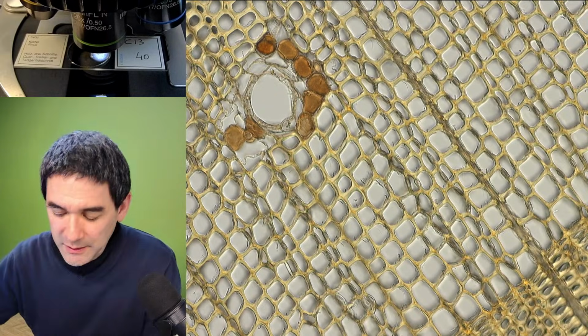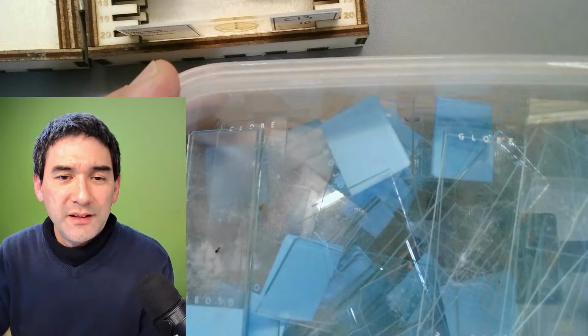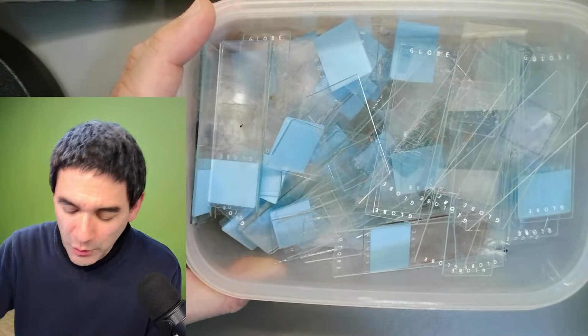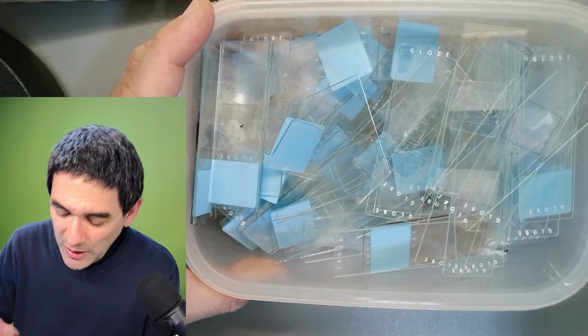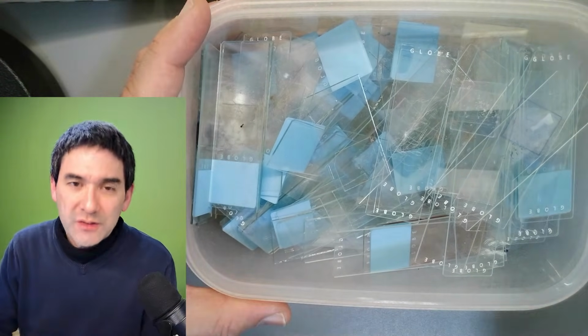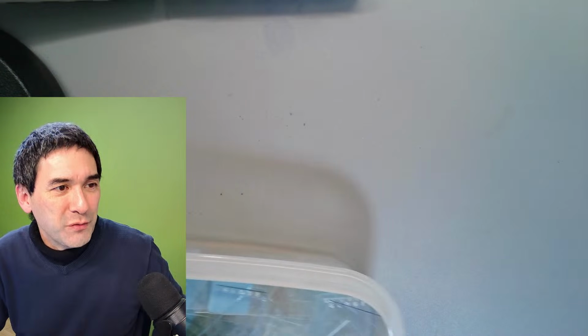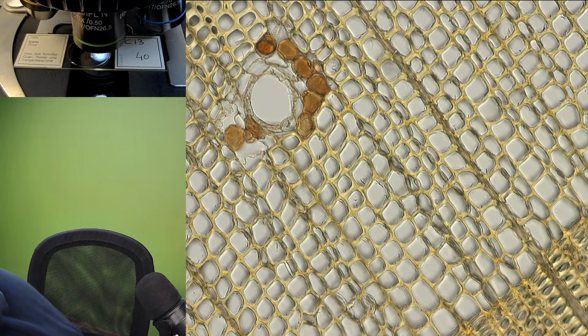I always dump the slides into a plastic box like this, right? And then I wash them. I pour hot water over it, and then I wash each one individually. So I'm reusing those. That's basically how I do most of my microscopy work.